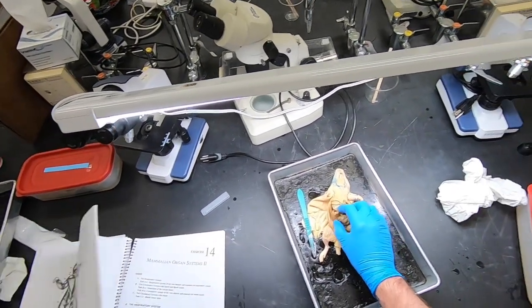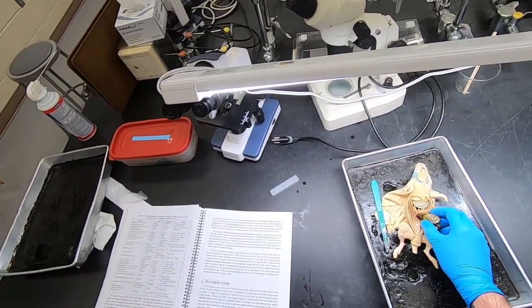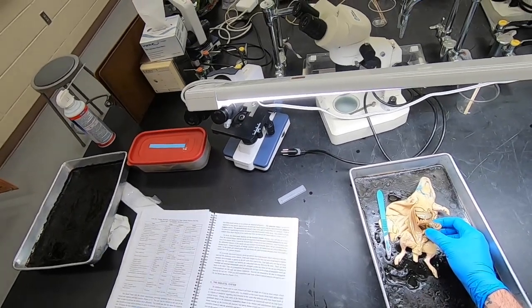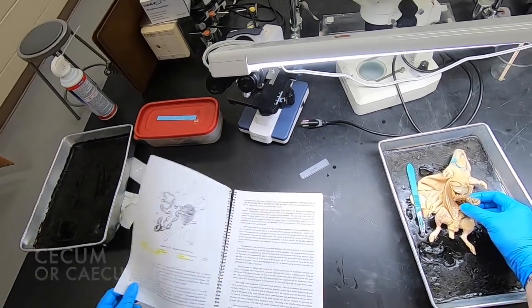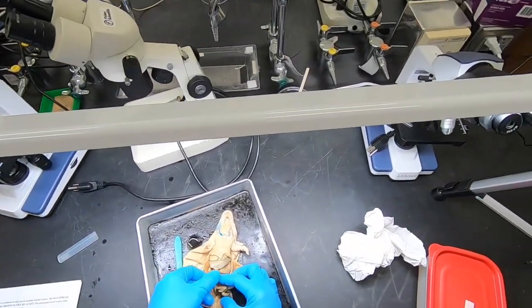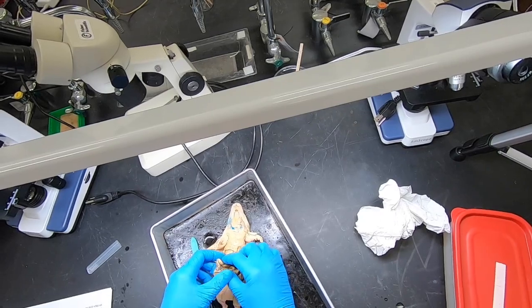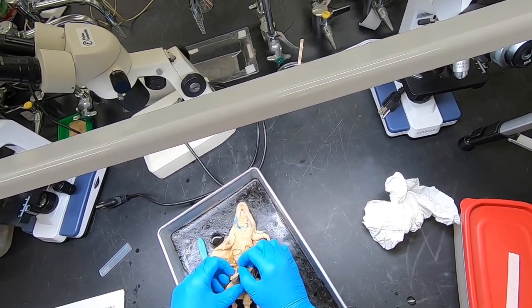At the end of the small intestine, we come back to the cecum. Recall the cecum is the structure which is homologous with our appendix.